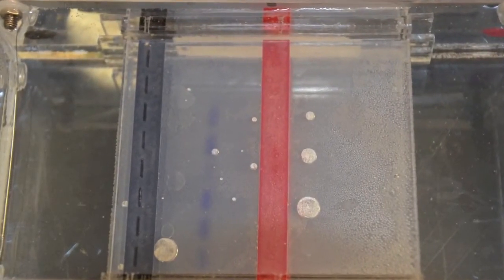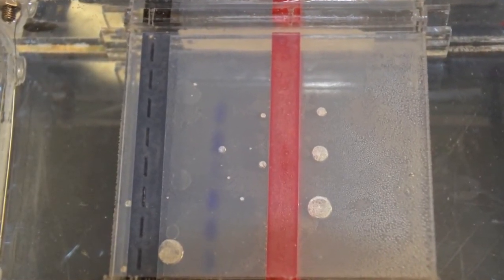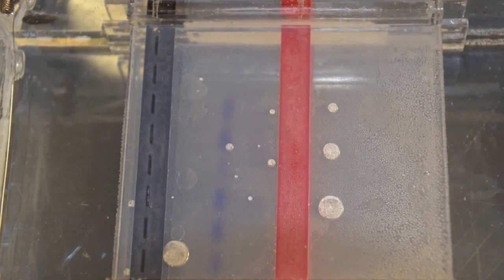As the electrophoresis is running this is what the band should appear to be moving along down from the negative current to the positive.